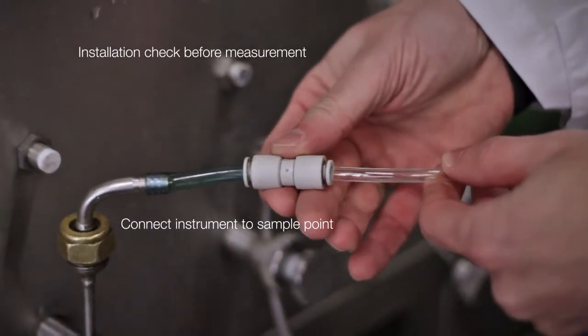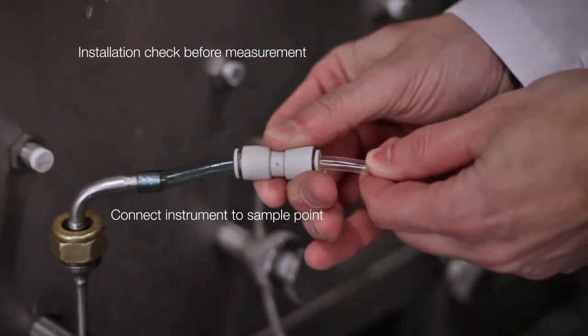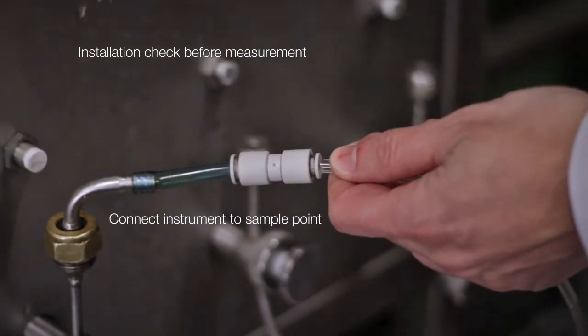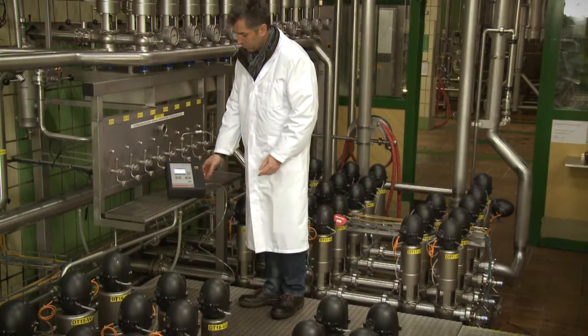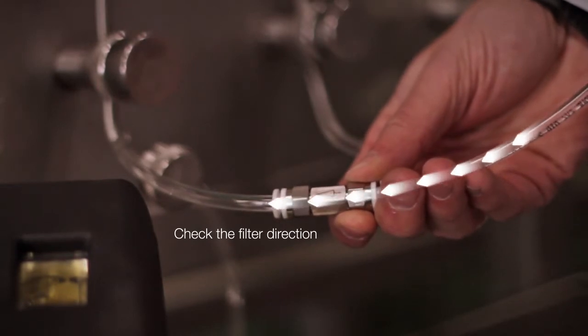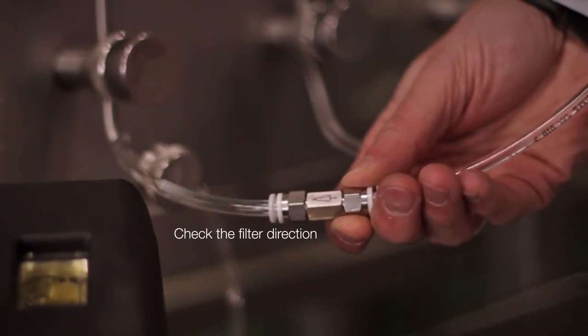First, connect the instrument to the sample point and make sure that all hoses are tightly fixed. The ball valve in the back is fixed in the position you see here. The ATLINE filter between the sample point and the instrument's sample inlet must be implemented correctly.